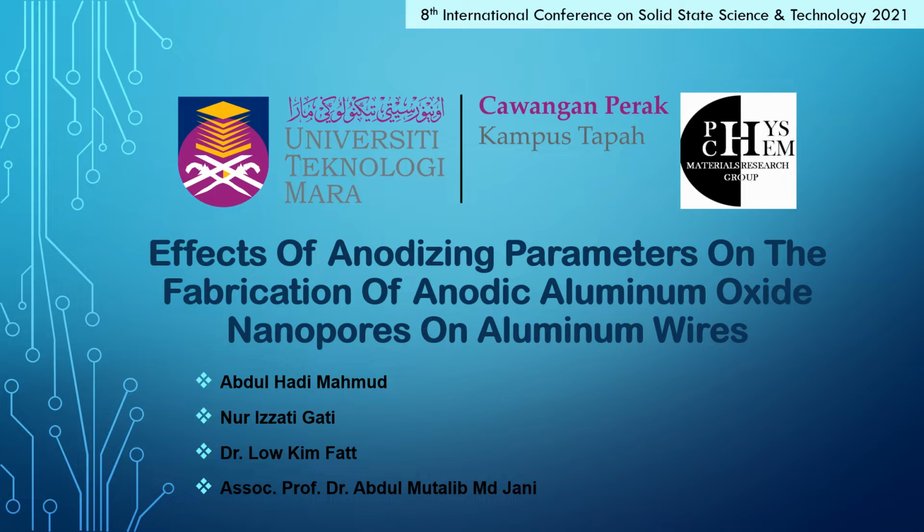The title of my presentation today is Effect of Anodizing Parameters on the Fabrication of Anodic Aluminum Oxide Nanopores on Aluminum Wires. My research involved developing an immunosensor to detect porcine serum albumin in raw meats. One of my objectives was to fabricate anodic aluminum oxide in its wire form for that application. So today I would like to share some of my findings as I characterize the anodic aluminum oxide I fabricated.